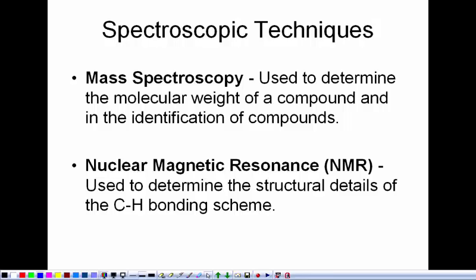Well, the mass spectrometer can actually be used to identify the structures of molecules, and we'll talk about how that's done. So that part is real. A lot of the other stuff, the time it takes, is not real on TV, and they take liberties with how easy it is to get structures. But we'll talk about mass spectrometry.